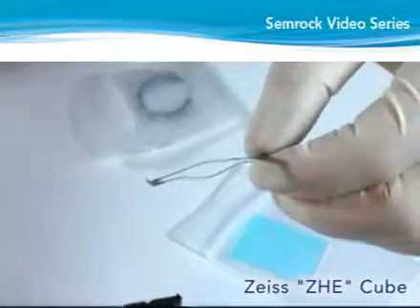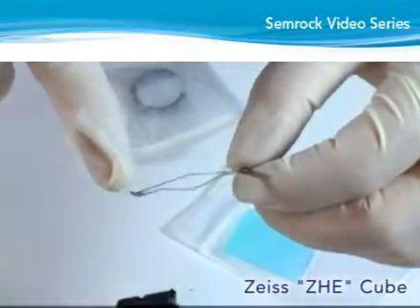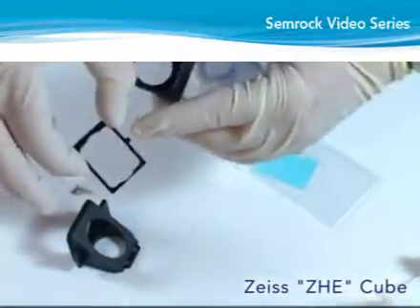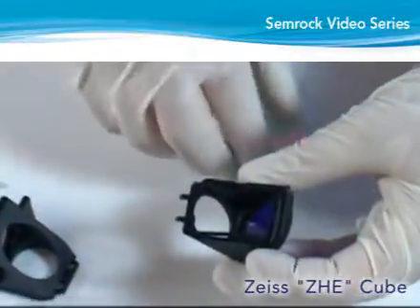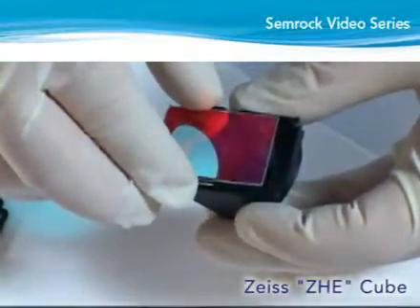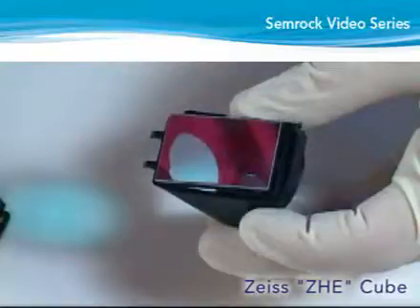Lay the spring clip on the rectangular area with flanges at either end facing upward, and the locating tab inserted into the notch in the emitter half of the cube, such that the rectangular area where the dichroic goes is horizontal. Lay the dichroic on top of the spring clip with the reflective coated side facing upward and away from the emitter portion of the cube. Position the dichroic between the two upward facing flanges at the ends of the clip.